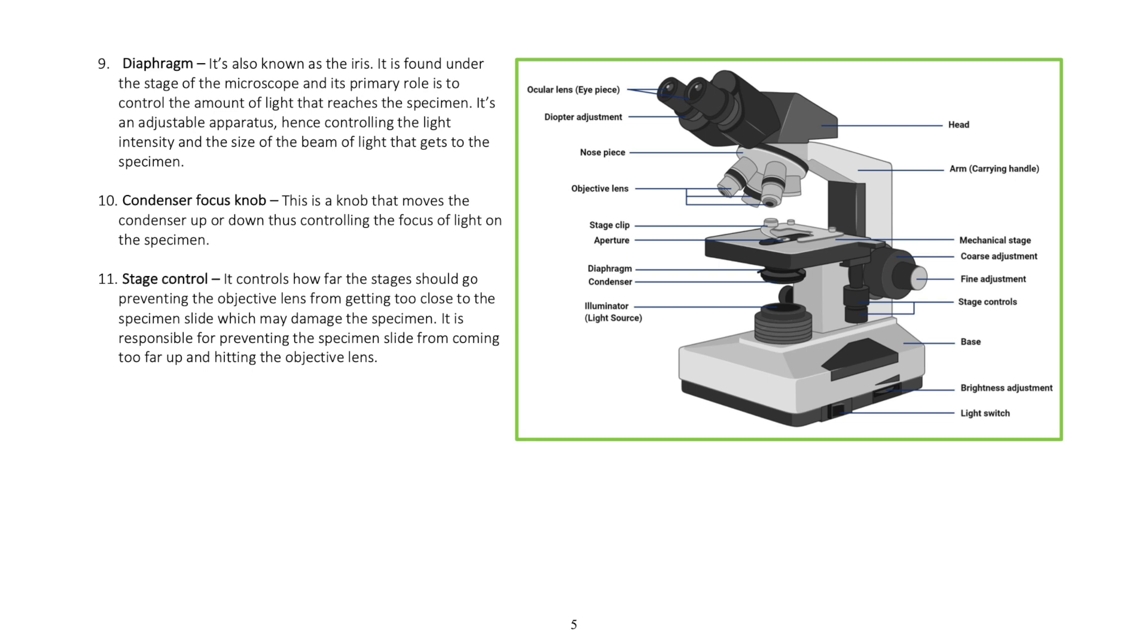Stage control controls how far the stages should go, preventing the objective lens from getting too close to the specimen slide, which may damage the specimen. It is responsible for preventing the specimen slide from coming too far up and hitting the objective lens.